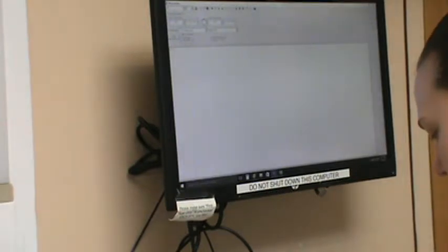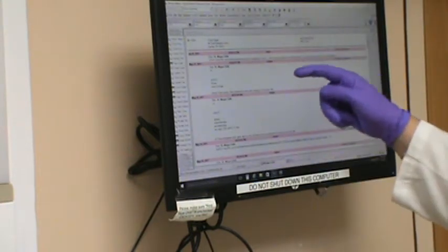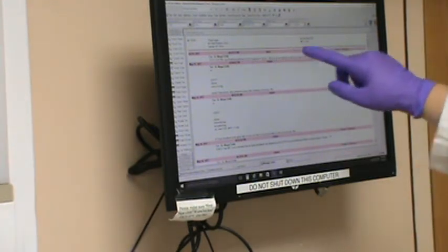I'm going to put today's date, the time, and then I'm just going to say, I just finished performing a skin scraping on Gizmo. I did not see any parasites or abnormal cells, so I am going to call his skin scraping negative. Just put my initials, TF. We're going to hit apply. And then once I hit OK, you should see a new line right here that got added in, which is the sentence that I just put in saying that it is a negative skin scraping.